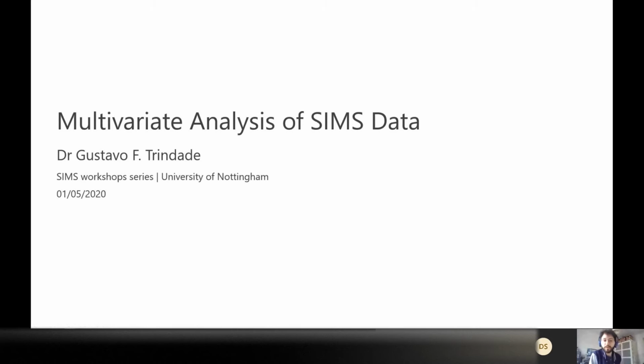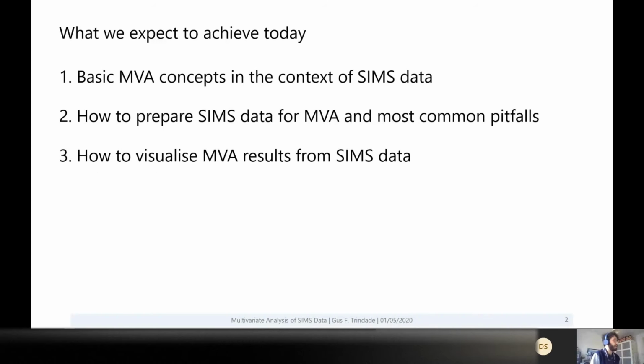So, yeah, this is part 1 of 2. First, instead of just talking about the software, it would be nice to introduce all the concepts around this, assuming that not everyone is familiar with MVA in ToF-SIMS and OrbiSIMS. So before that, I just wanted to list what we expect to achieve today.